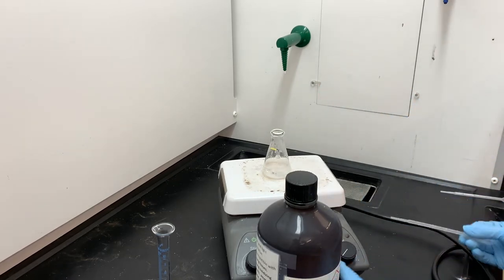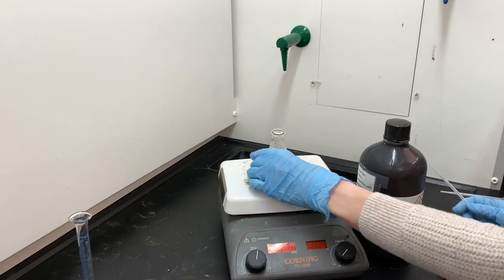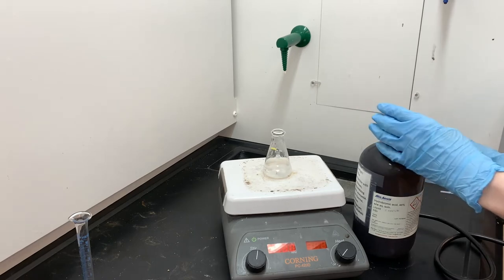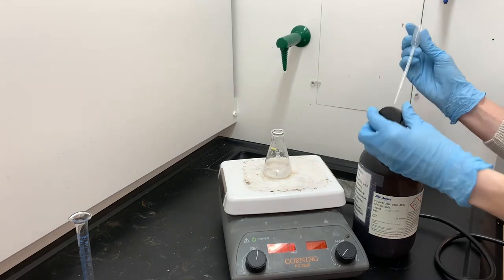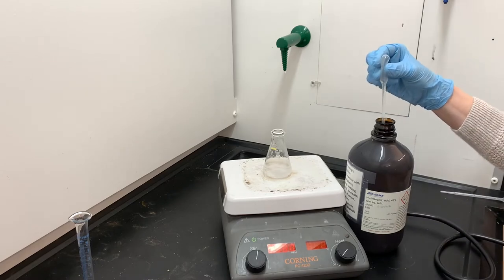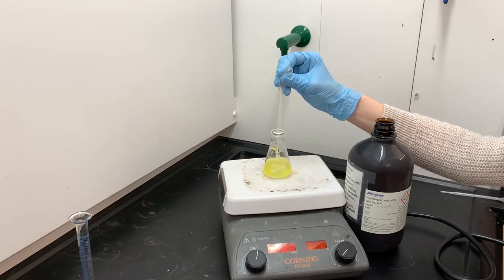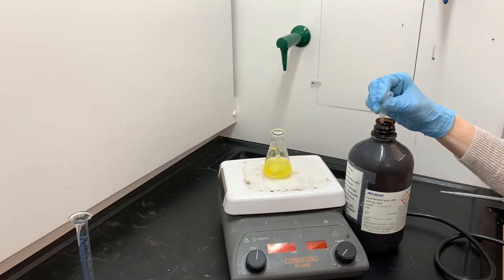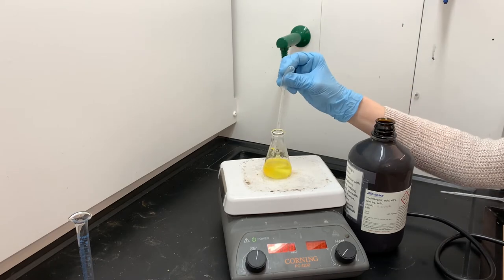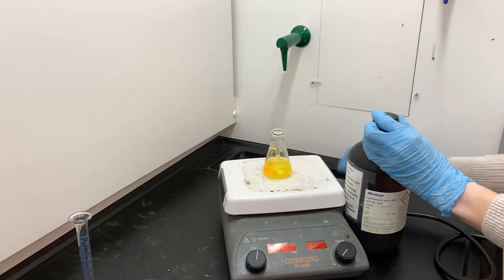Up to the top there is 1 milliliter, so 2 squirts of hydrobromic acid. It's probably going to be equivalent to 2 milliliters. These little disposable pipettes are not super accurate, but for me, much safer than trying to measure it out in a little teeny tiny graduated cylinder.